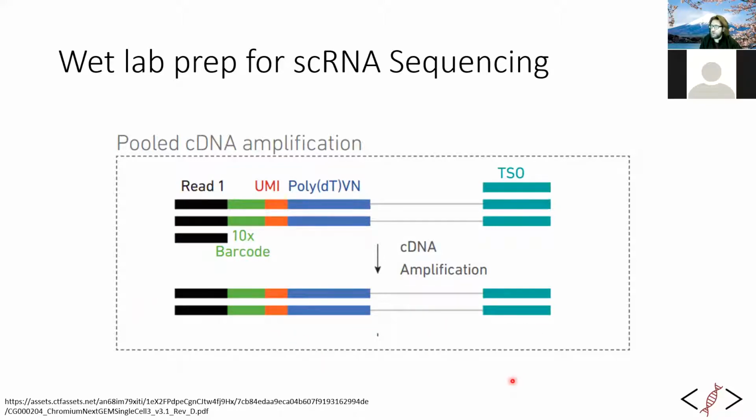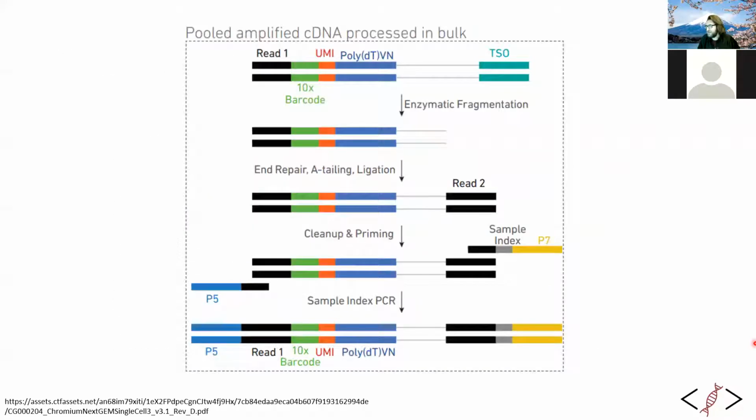And because of that, you can figure out the degree to which any particular read was amplified too much or too little. And that's something that we tend to deal with when we do the quality control pipelines for single cell RNA sequencing. All right, the final steps here all have to do with the actual library preparation.